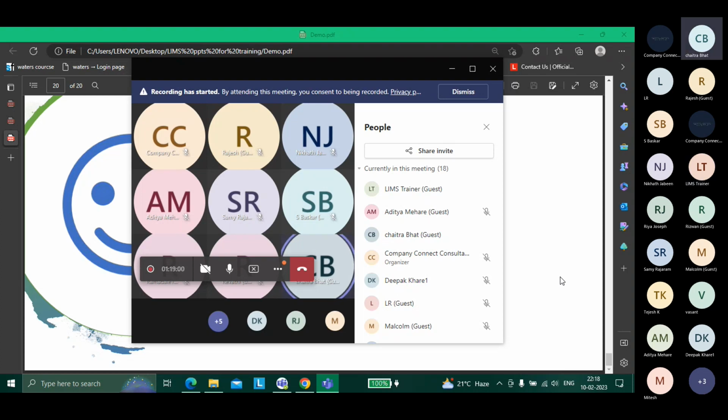Now all pharma companies are moving to ELN, right? ELN. I think I missed your word. Can you explain that in LIMS? ELN chapter in that course. I don't think ELN is included here because ELN, electronic ELN, is a separate part.